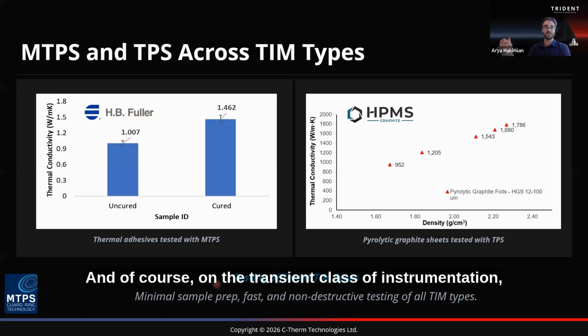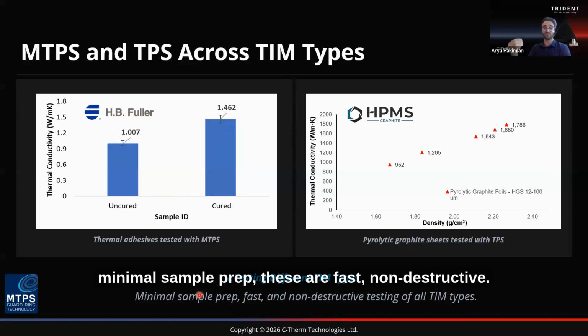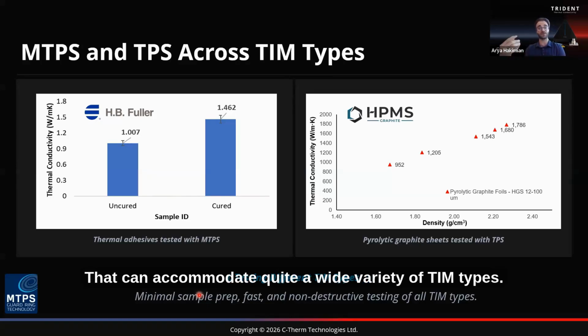And of course, on the transient class of instrumentation, minimal sample prep, these are fast, non-destructive, and can accommodate quite a wide variety of TIM types.